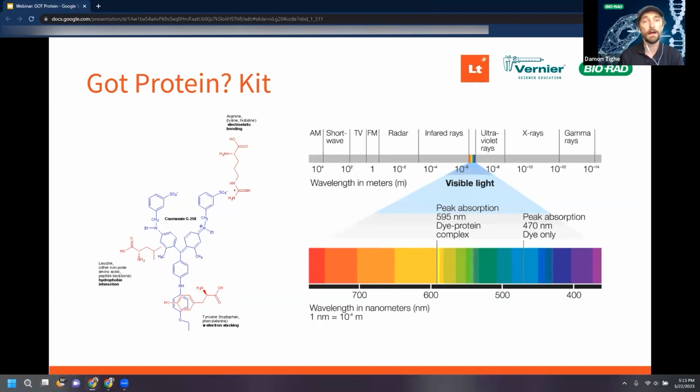And so if you've got a really high concentration of protein in your solution, you all of a sudden go from this kind of brown, rusty solution to a bright blue solution. And with the aid of a spectrophotometer, you're going to be able to get a very, very precise diagnosis of how much protein you actually have in your sample. And the way that we'll do that is with what we see on the next slide.